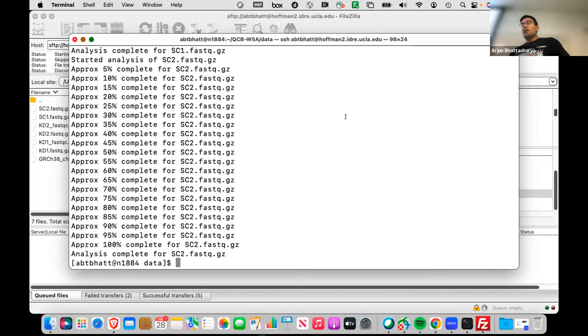So it's really hard to interpret just from these HTMLs. If you have lots of green checks and a couple of red X's, that's usually not a bad thing.